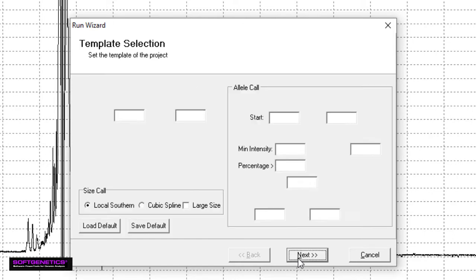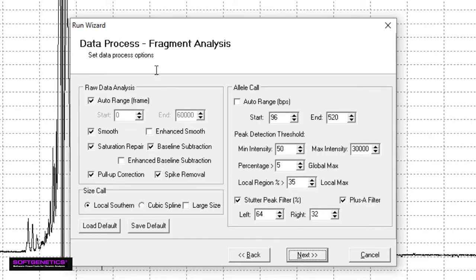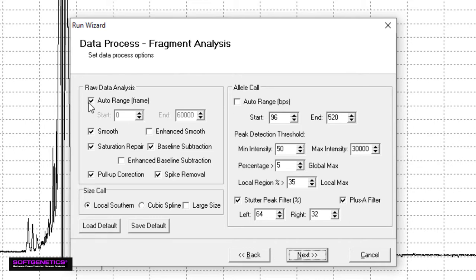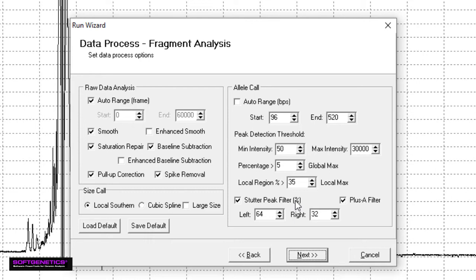Here, you can set the analysis parameters for your project. These parameters are broken into three major sections. These options to the left pertain to how the raw data is processed. This lower option allows you to select how size calls are made. And finally, this section to the right influences how allele calls are made, including how stutter peaks are filtered. For more information regarding optimization of these parameters, I encourage you to read Chapter 2 of the User Manual. However, for the majority of the applications, the default settings will work just fine.